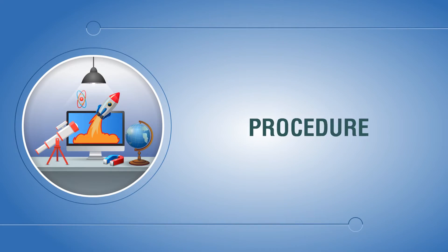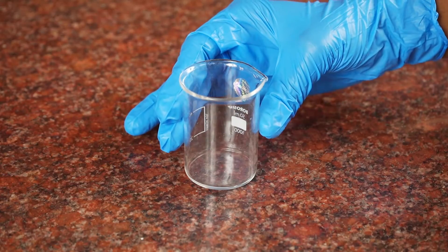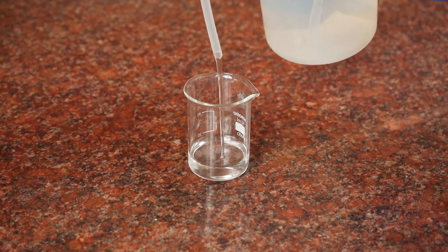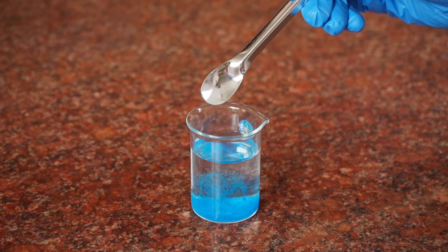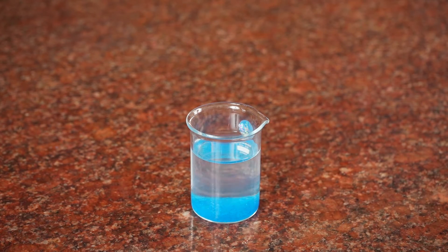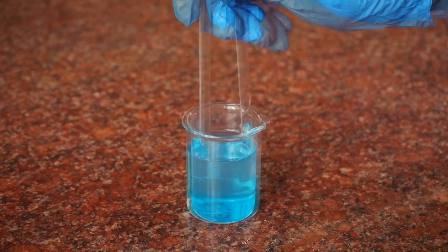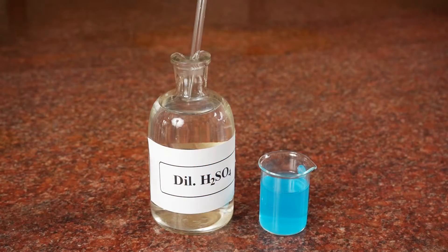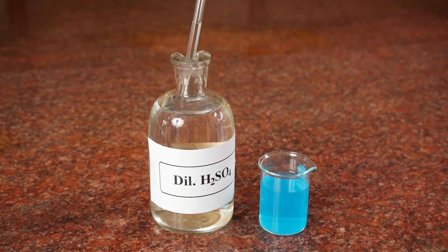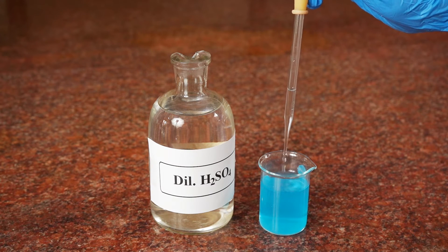Procedure: Take a 100 ml beaker and add about 50 ml of water. Pour about a spatula full of copper sulphate in water and stir the solution using a glass rod to dissolve it. Add a few drops of dilute sulphuric acid to the solution using a dropper.